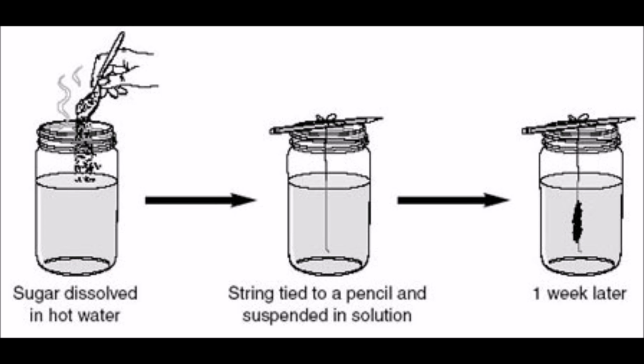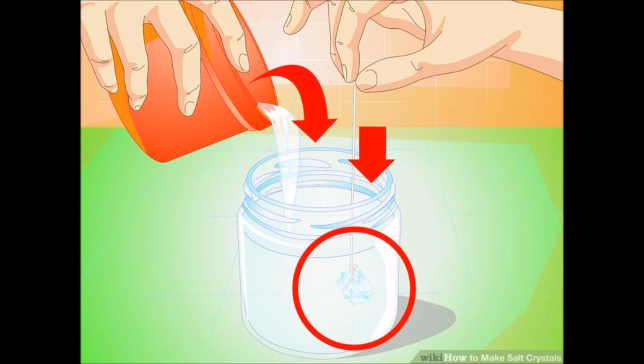In order to make sodium chloride crystals, we would boil water and then add salt to the point where it was saturated. We would know this because as we added the salt, no more salt would dissolve and it would sink to the bottom. The solution would then be let to cool, and as the solution slowly cooled, the crystals would form as the solute precipitates.